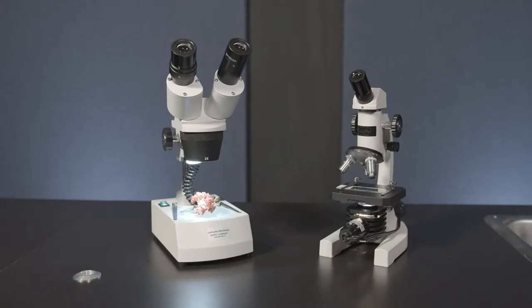There are two basic types of microscopes that are used in the typical classroom setting: stereo or dissecting microscopes and compound microscopes.